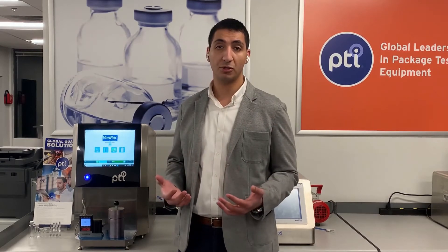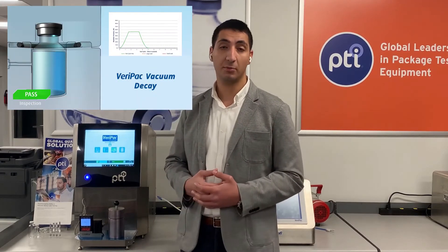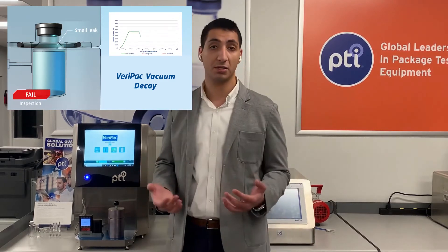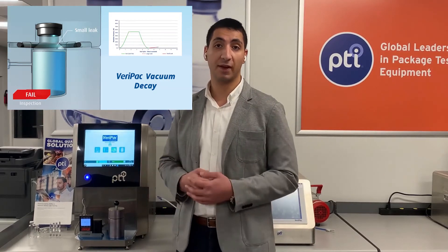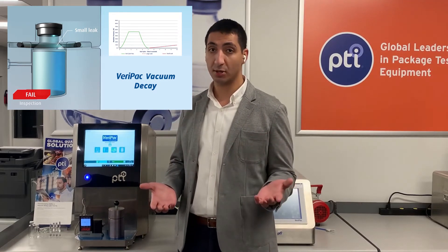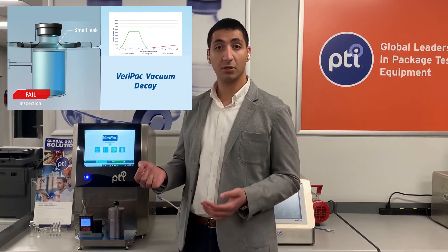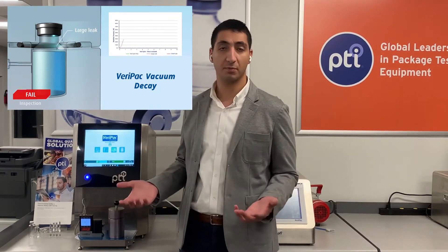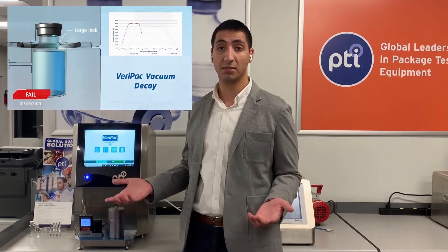The multi-cycle approach allows for prevention of excessive contamination of the test chamber, as the system will immediately abort the test cycle upon detection of a defect. Since cycle 1 will detect those large leaks, if there is a large defect in the container, it will abort within the first couple seconds, effectively also reducing the test time.